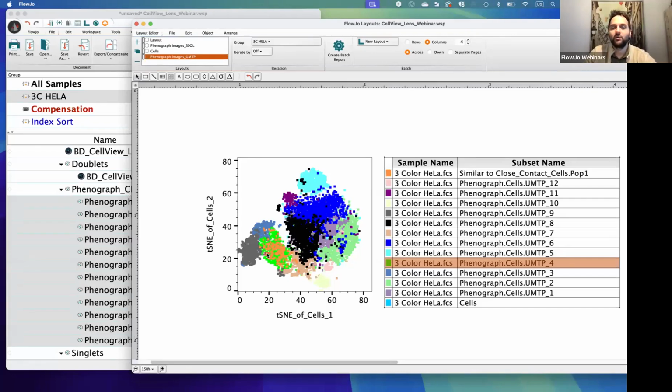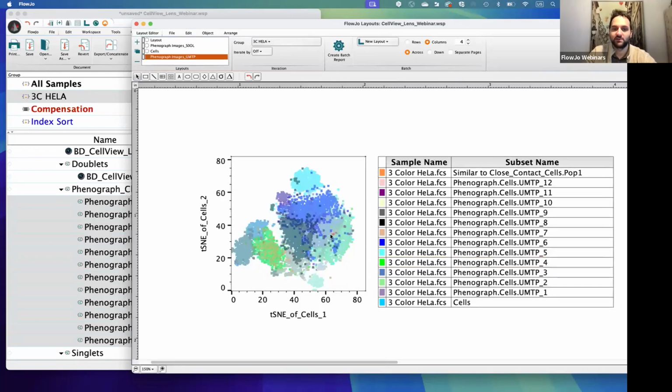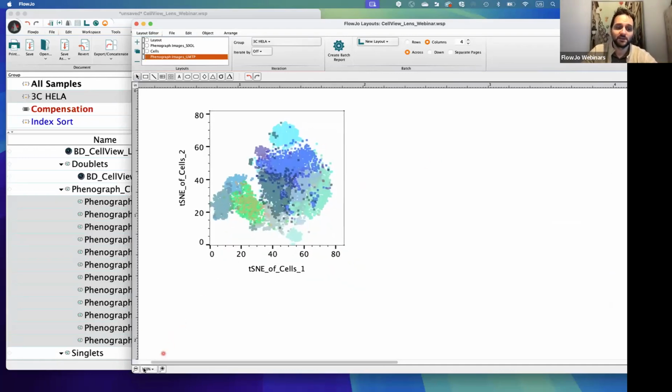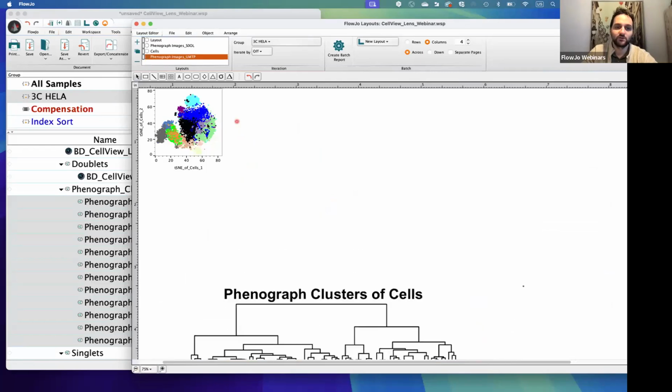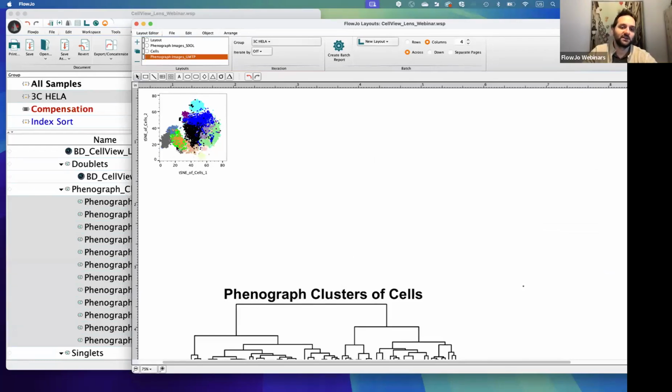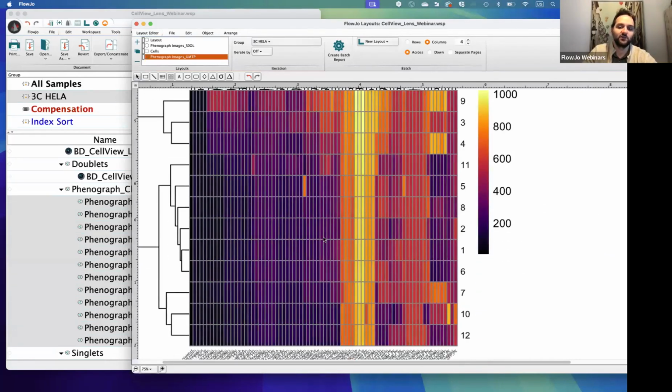So now we can move to how we can identify what this expresses. The traditional way of doing that is, you could do a heat map in here. So you can do a heat map and see, for example, which parameters are expressed here, or use this phenograph clustering to see what your cluster expresses and design a gating strategy.